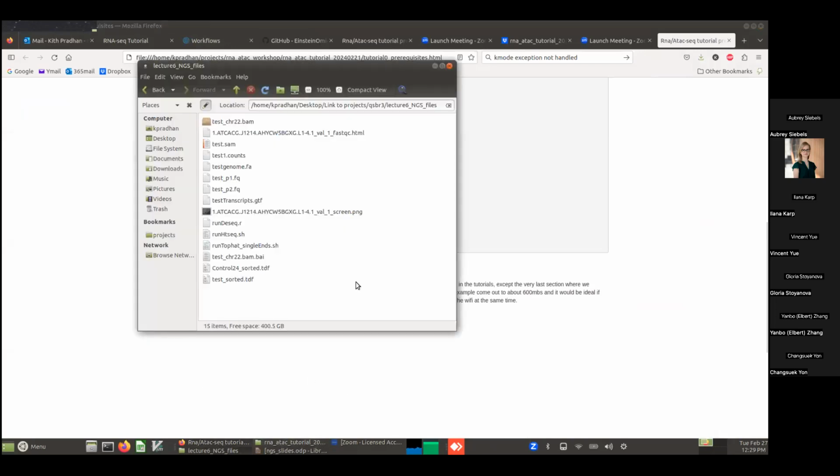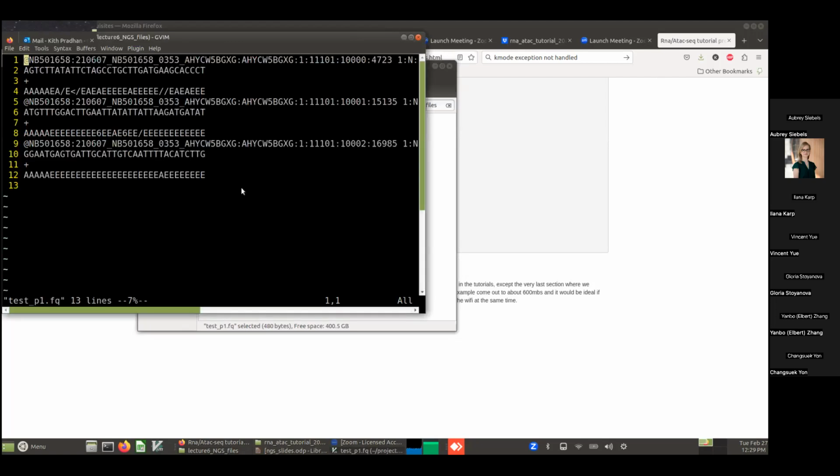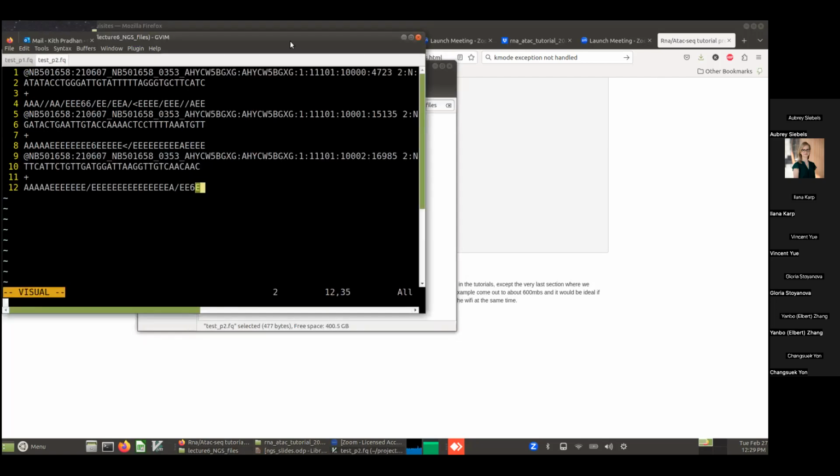So, actually, maybe before we start, this is important. Who here has actually opened up a FASTQ file, one of those raw sequencing files? When I started out, all this raw data coming from a machine was overwhelming and scary to deal with. It's like this machine is spitting out all this complicated information. But really, you can just open it up in a text editor. It's a text file that has information on these fragments that are sequenced.